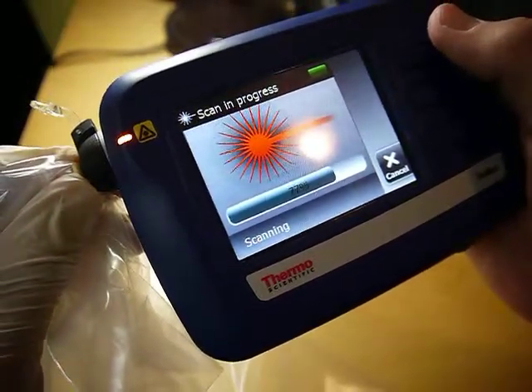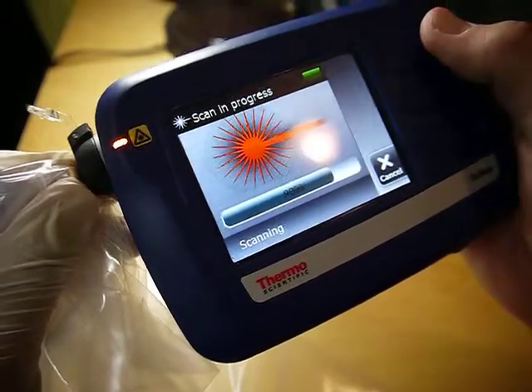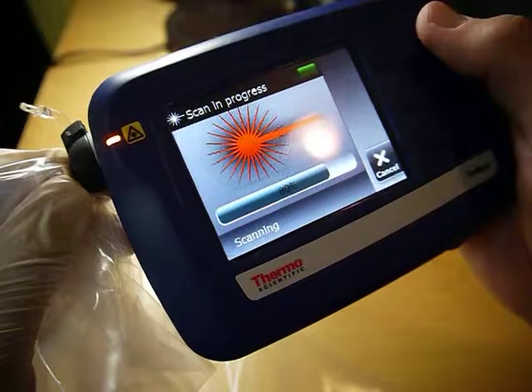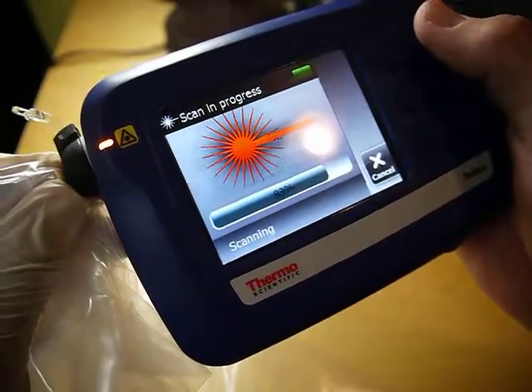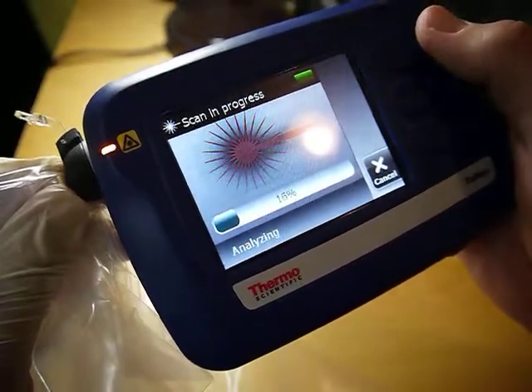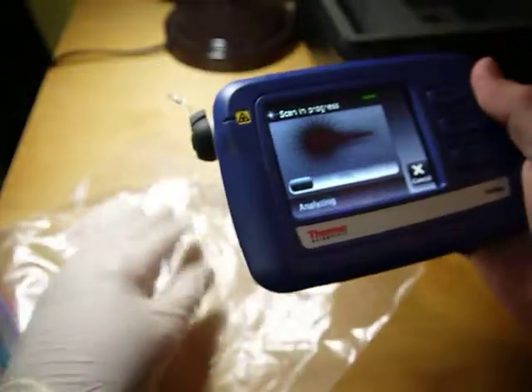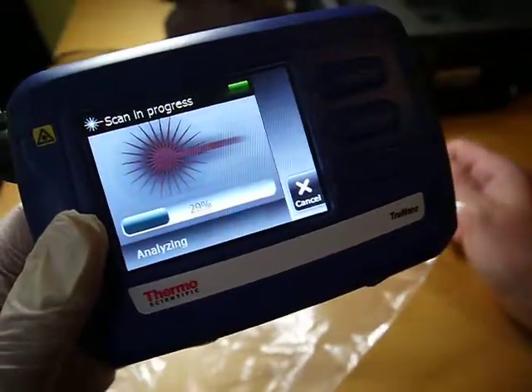When I originally tested this, I didn't know it was in the library, but it did identify it. Now the laser's turned off and it's analyzing, comparing that waveform to what's in the library.